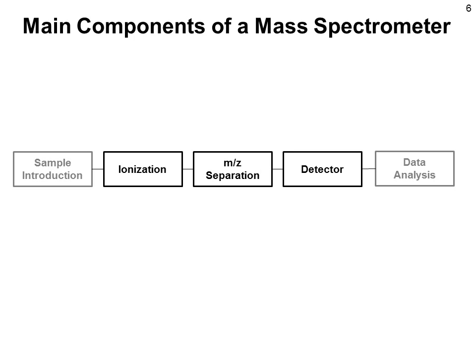However, in order to quantify molecules, we obviously need to calibrate the instrument. We need to know how many ions correspond to which concentration of the molecule in the sample, because none of these processes is 100%. Ionization may only be a few percent. We lose ions during the transport and in the mass analyzer, and also the detector does not give a signal for every ion that hits.